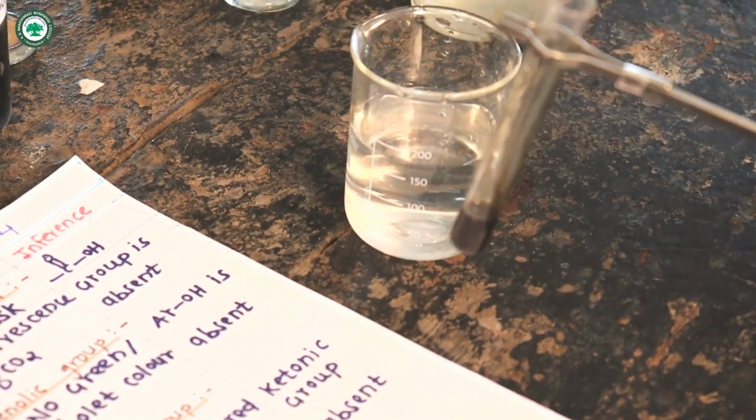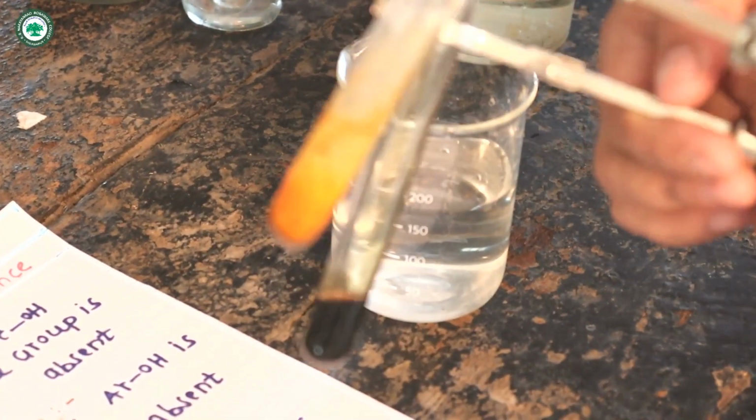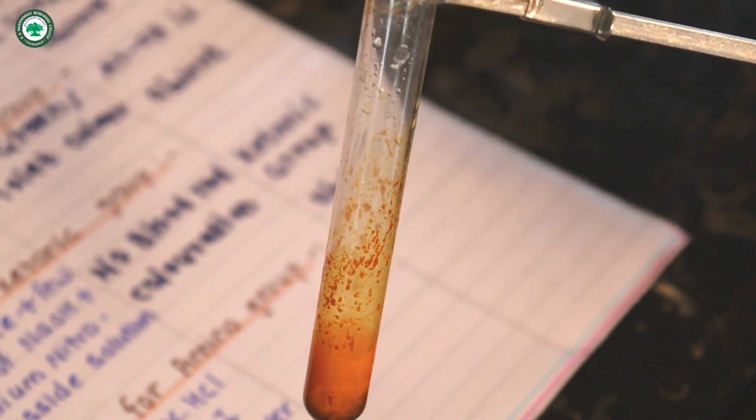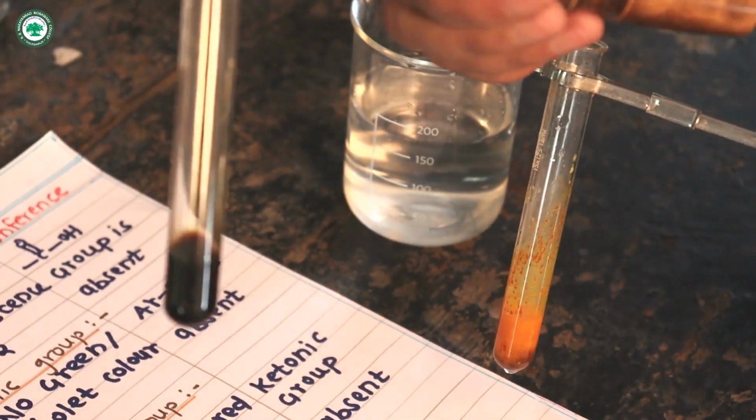Add cold solution. This is our first test tube, in which substance plus concentrated HCl is taken, plus sodium nitrite, and then cooled under tap water. In the second test tube, beta naphthol in NaOH. Then add the cold solution to the second test tube.